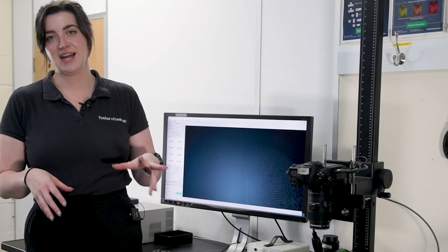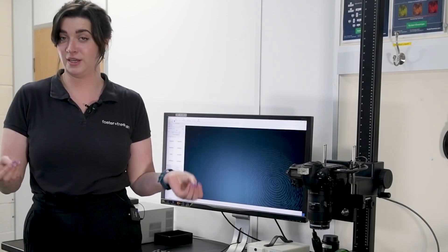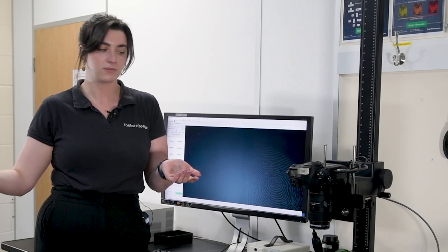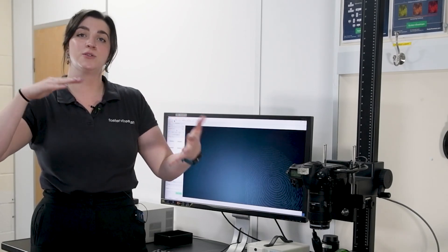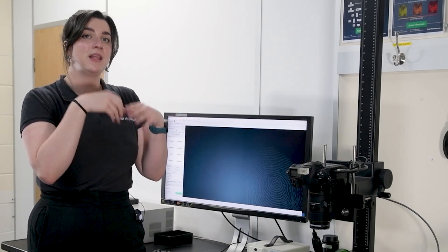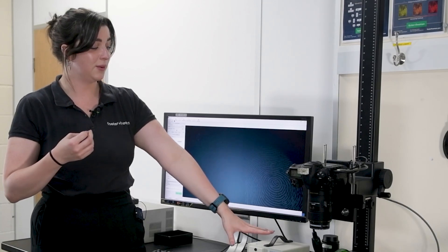The next technique is called extended depth of field. There are a couple of different places where this can be really useful when photographing fingerprints, particularly difficult ones. The general guidance in forensic labs is that if you can see a fingerprint, it must be photographed prior to treatment and again post-treatment. Extended depth of field is especially helpful for fingerprints on curved surfaces, where you can tilt the item to a certain angle and visibly see the fingerprint, but it's very tricky to actually photograph.